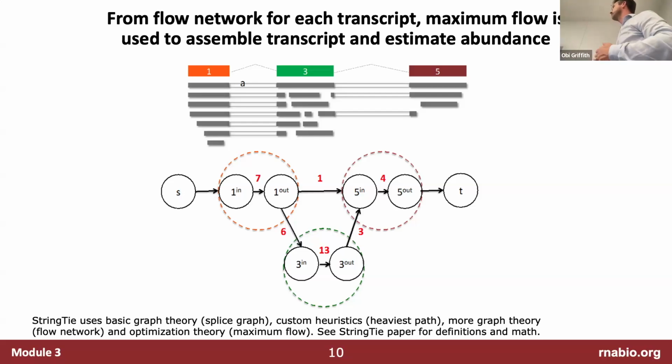But at a high level, it's trying to squeeze all the juice out of the orange that you get from short read sequence data and do the best job possible of getting isoform level expression estimation.